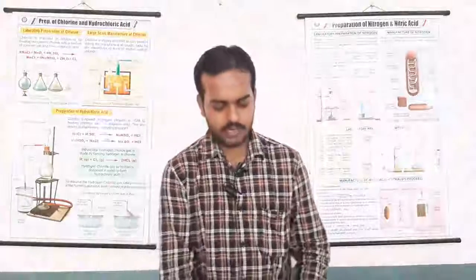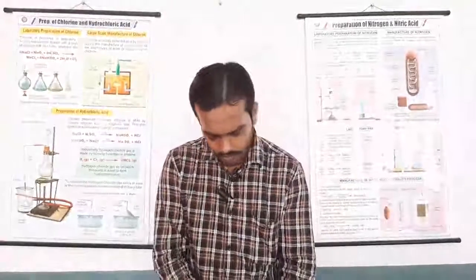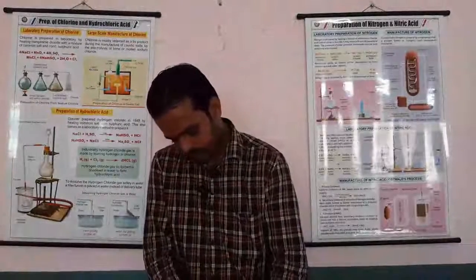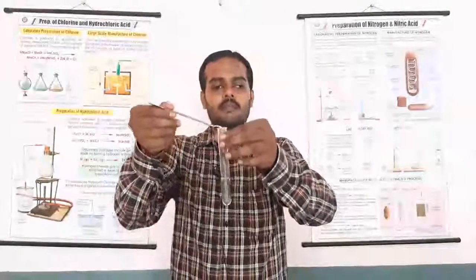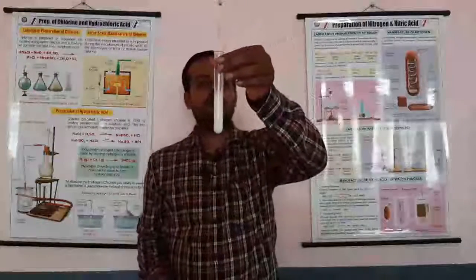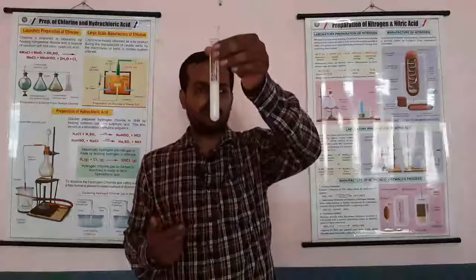So, we have taken sodium carbonate here. We will add a small quantity of sodium carbonate to the acid using the spatula. Let us see what happens. You can see the formation of white bubbles, and the bubbles are coming very vigorously.